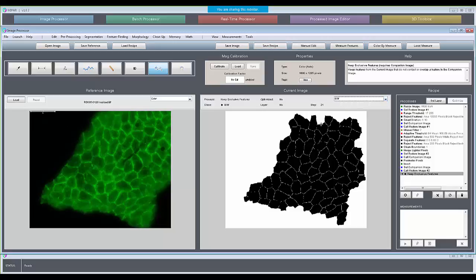I'm not quite sure what metrics were of interest here. Probably cell size, I would say, at least, and maybe shape. You feel free to chime in, Reagan, if you've got more relevant metrics than what I'm playing with. If we just wanted to make measurements of the cells as a spreadsheet, well, let's calibrate first. Well, I can show you what happens if you don't calibrate.